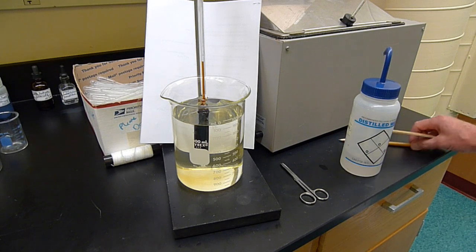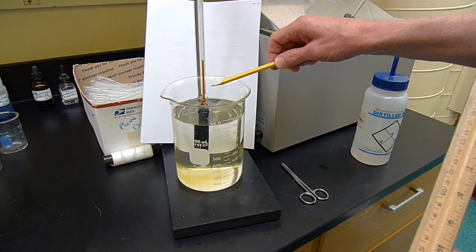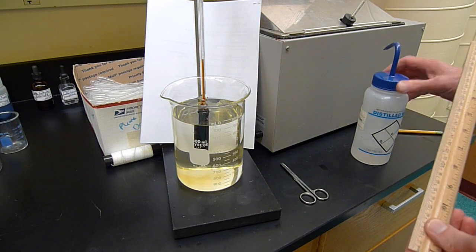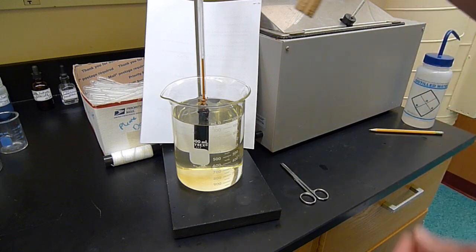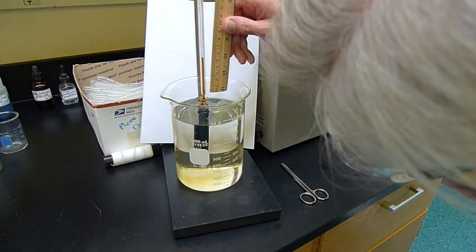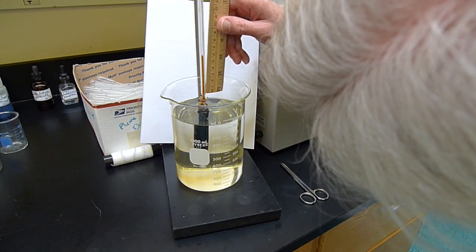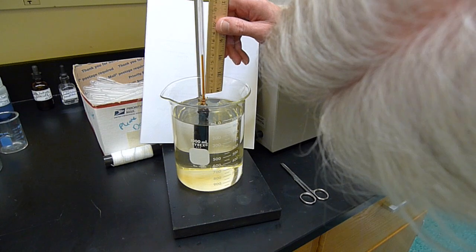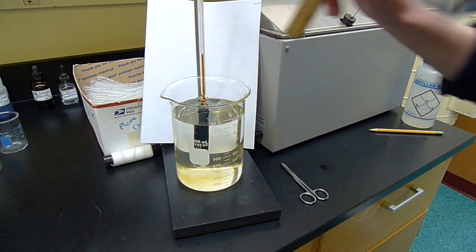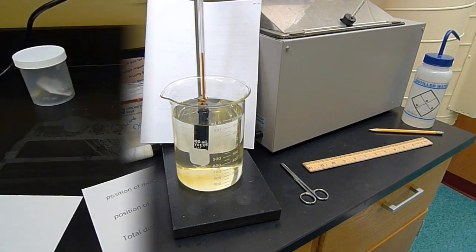And what I'm going to do is measure the position of the molasses above the edge of the tube. I'm going to measure it now, and then I'm going to measure it again in about 10 minutes. And we'll calculate a rate of how fast the molasses is getting pushed up the tube. And this, again, is due to osmosis. So I'm going to measure this position at, it's going kind of fast here, 61 millimeters. So the initial position is 61 millimeters.